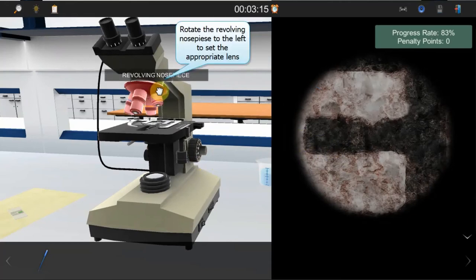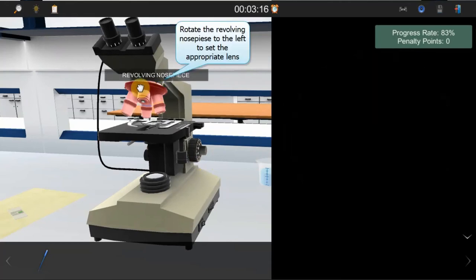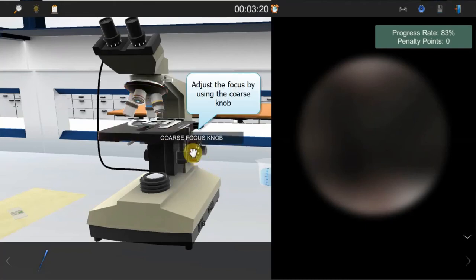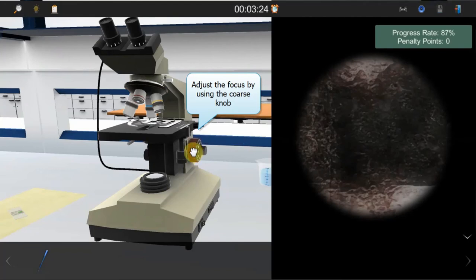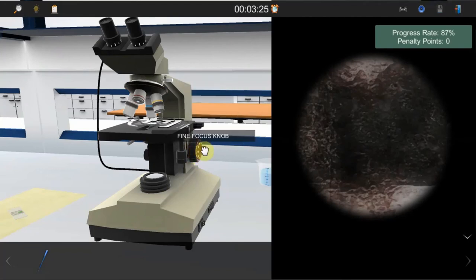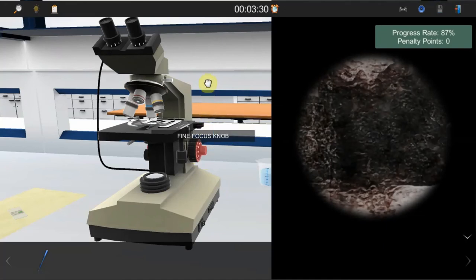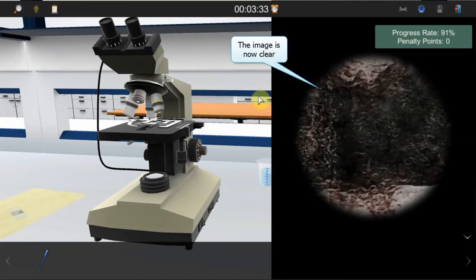Rotate the revolving nosepiece to the left to set the 40x objective lens into position. Focus on the specimen by using the coarse focus knob. When the image becomes clear, use the fine focus knob for more adjustments.